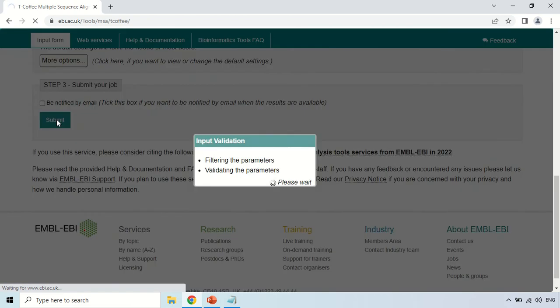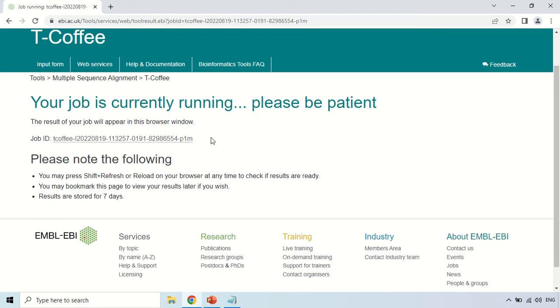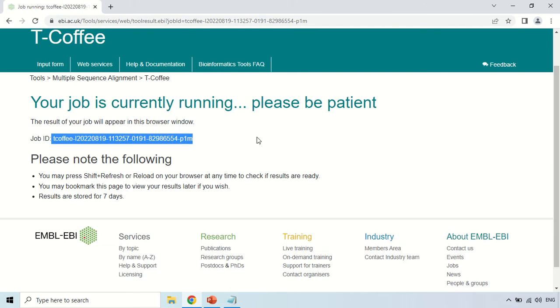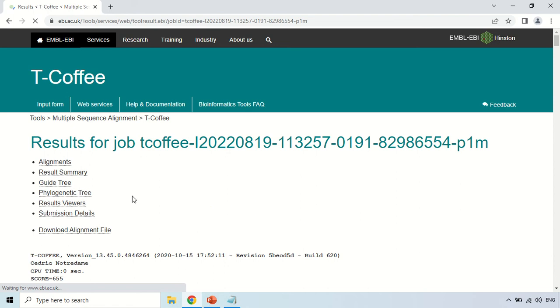As you click Submit, you can see that processing has started. As mentioned here, your job is currently running, and this is the job ID which is generated by the software itself. There are certain instructions: you can refresh or reload this page at any time if results are taking some time. If results take too long, you may also bookmark this page. The results are stored for 7 days on their server, so you must download your results within 7 days.